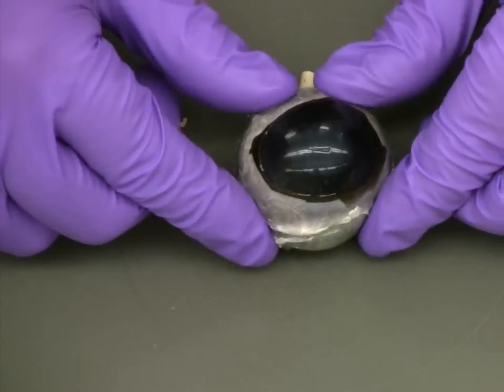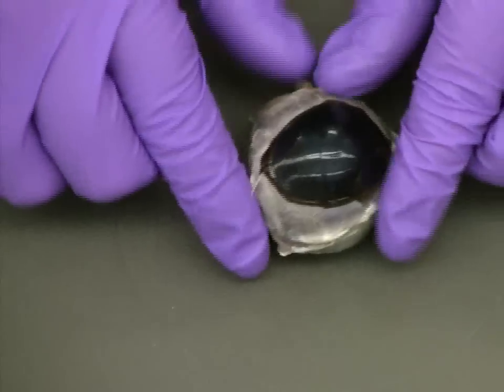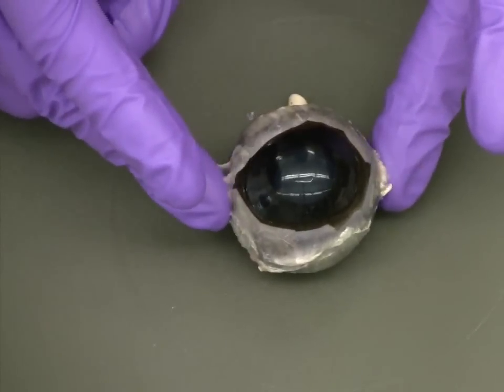Before we make the initial incision, it's important to note that the sclera of a fresh eye is very flexible, so it's important to be careful when handling your cutting tools and making the incision.